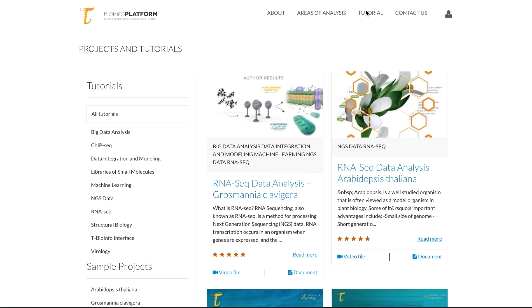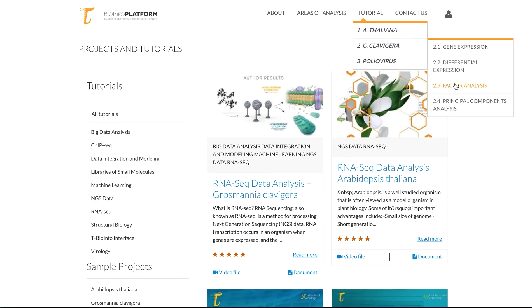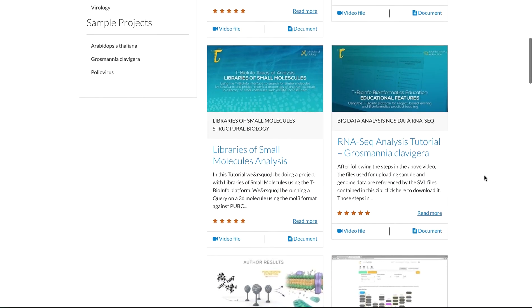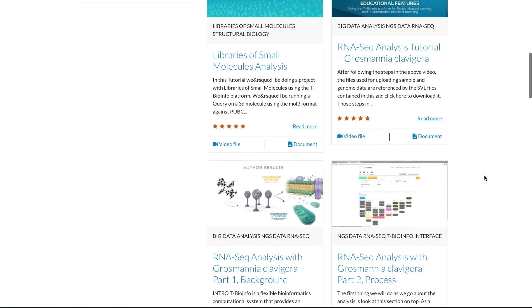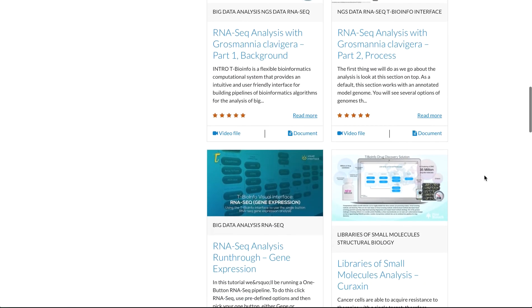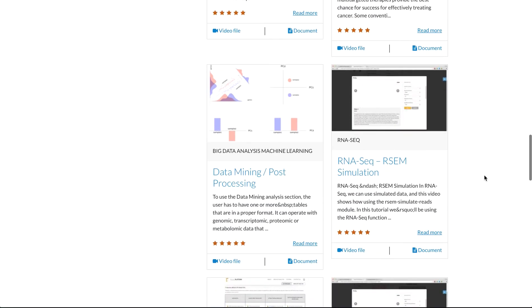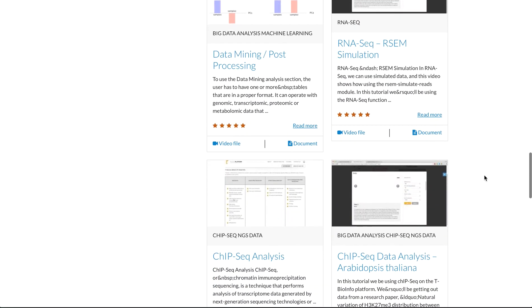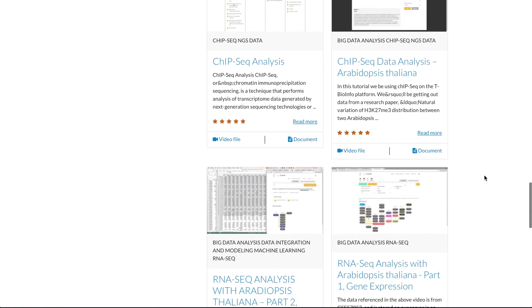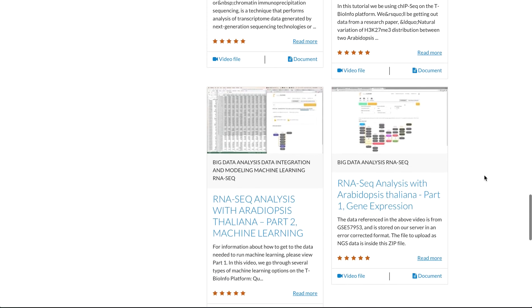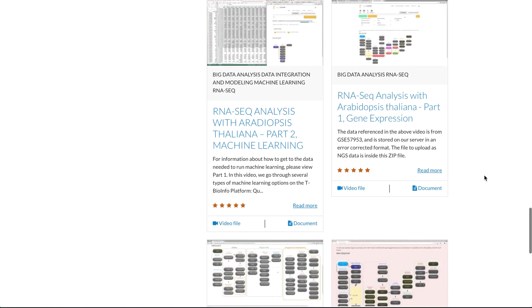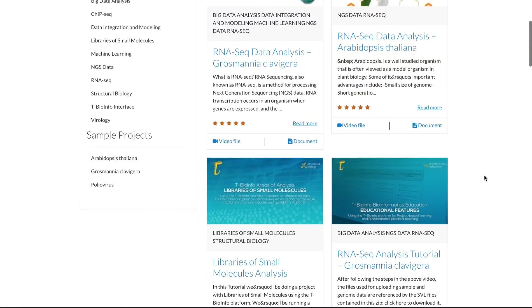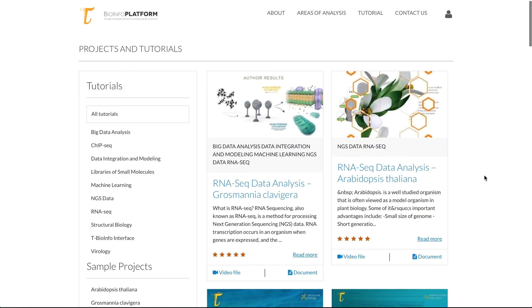We also have tutorials. These tutorials take example projects and focus on some specific data set and allow the user to use the system while following somebody else's example. They mostly have a video, text, and a downloadable PDF. And our goal with this section is to turn it into an area for education.